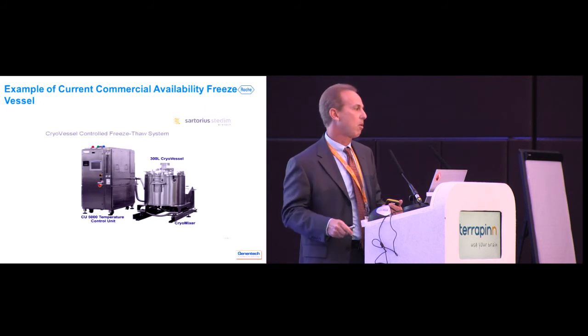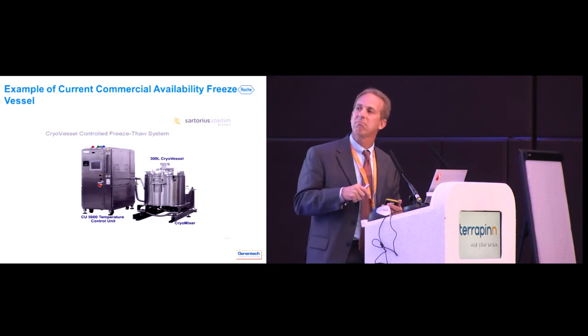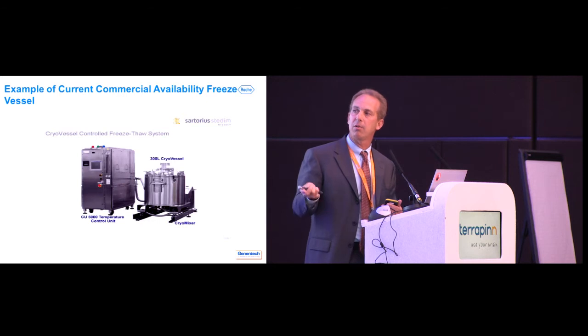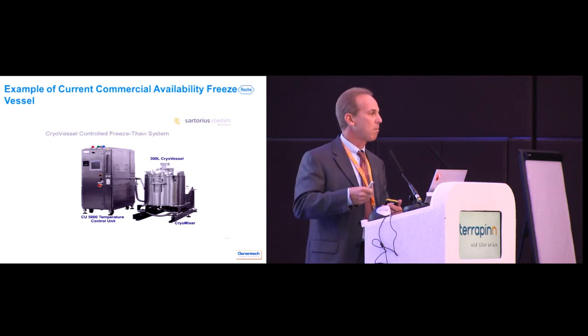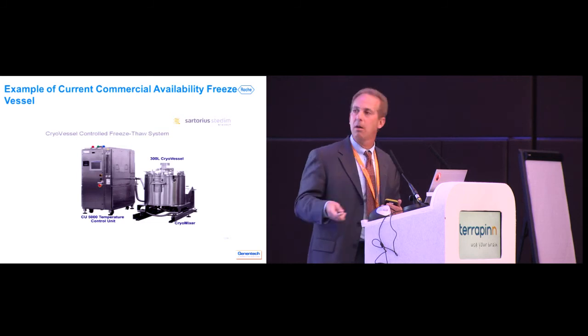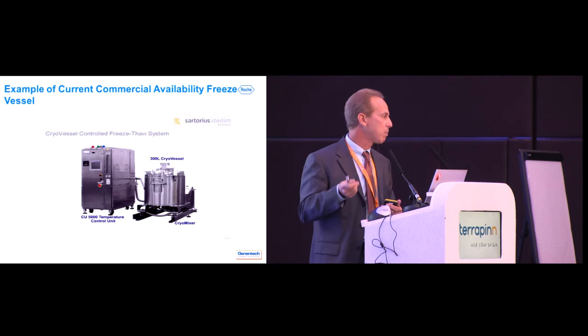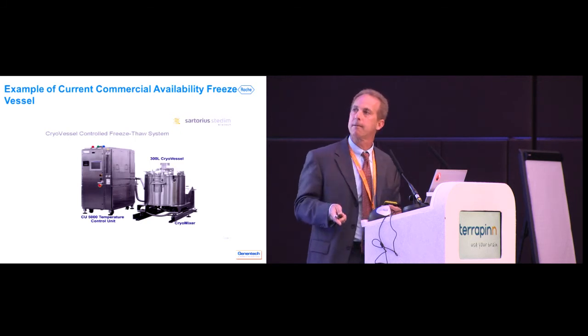Well, these tanks are about $175,000 apiece. I think Genentech has somewhere around 1,800 of them just in the US. And then you have to do PMs on them. They have to be cleaned, they have to be steamed, you have to do visual inspections. There is a small community, no joke, around just managing the tanks.